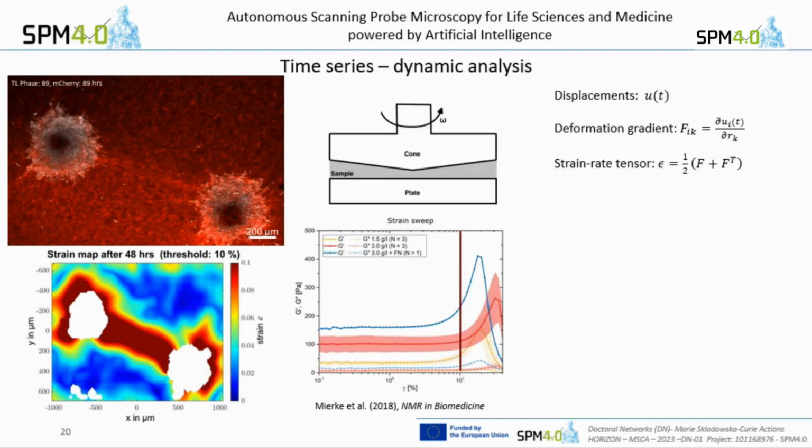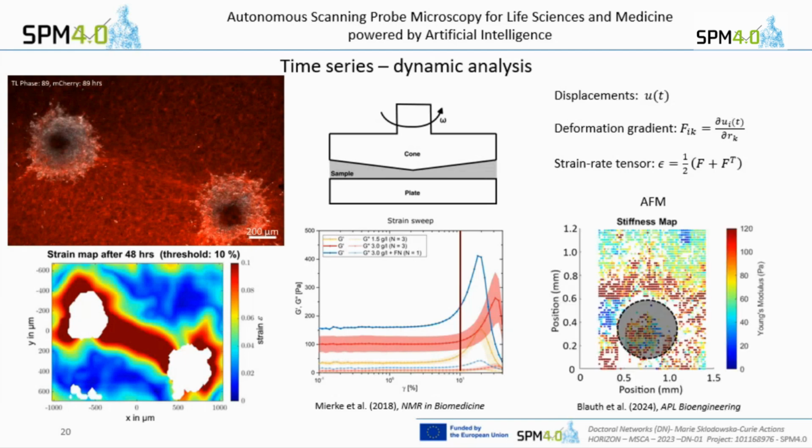We used here the yellow condition, and I just put in a number here at 10%. And everything that's above 10%, you can say that this is also getting stiffer. So you can see that this cluster of cells, the spheroids in these tumor pieces, have long-range stiffening effects on the surrounding matrix, at least in this lab system. Yeah, and we also measured it with AFM, where you can see that you have a stiffer collagen around the spheroid.